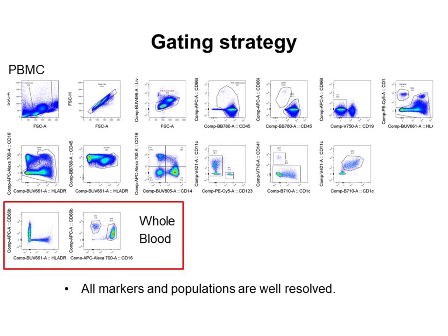The neutrophils and eosinophils can also be identified in whole blood, obviously. And for the rest, in the PBMC, you see the different cells: basophils, DC subsets, monocyte subsets, and so on. Again, I won't go into details for this. If you're interested in these core panels and some of the details, we can reach out.